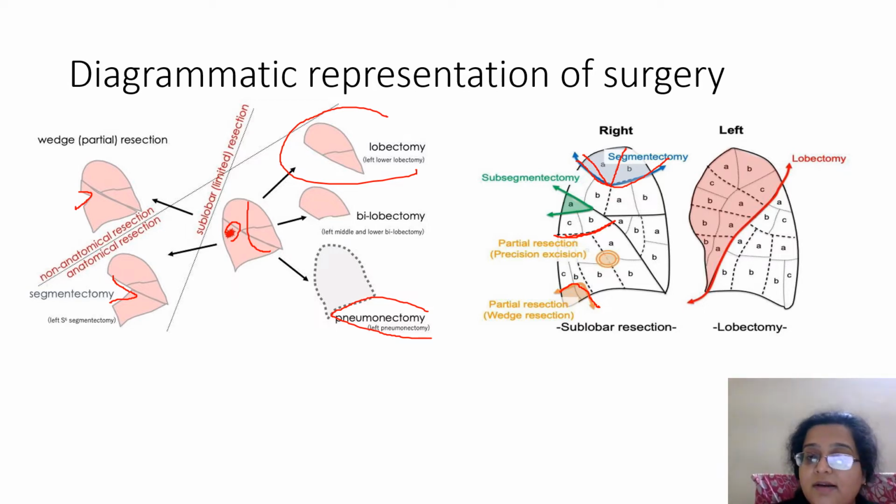These segments are divided as per the blood supply and blood drainage from them. So depending on that, these segments have been divided into A, B, etc. Normally the resections, the lobectomies, are done along the fissures, the oblique and the horizontal, and the longitudinal that the lung has. As you can see, going along the fissure on the left side, can you see an entire lobe being removed? So the lobe depends on the direction of the fissures. Then there are segments depending on the supply, and then the ectomies depend on what part of the lung is being removed. Okay.